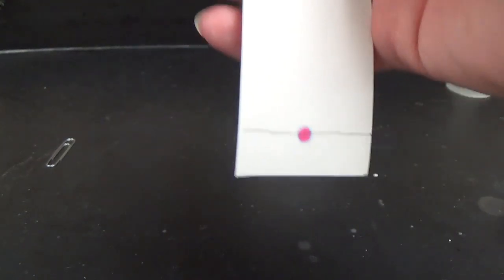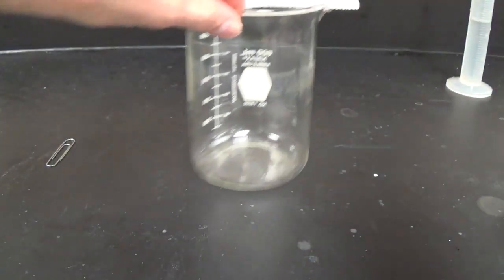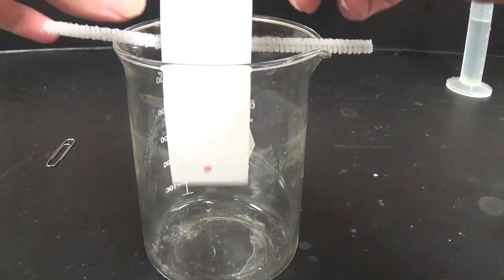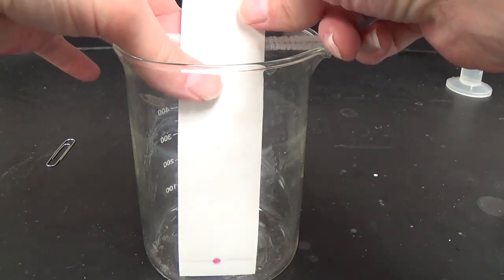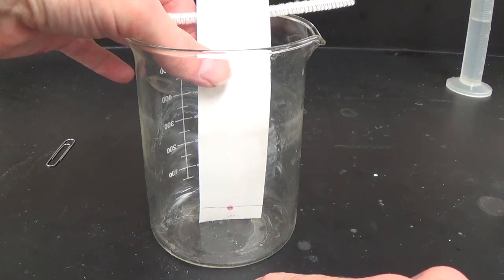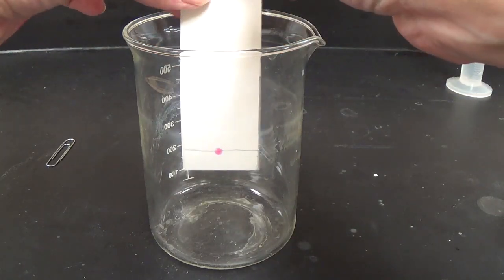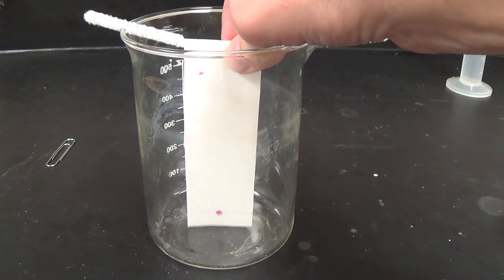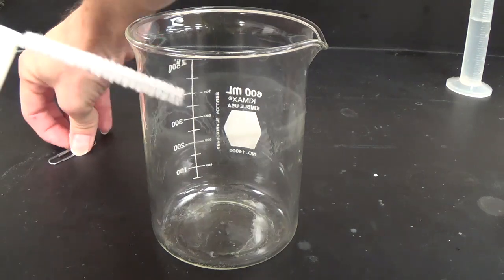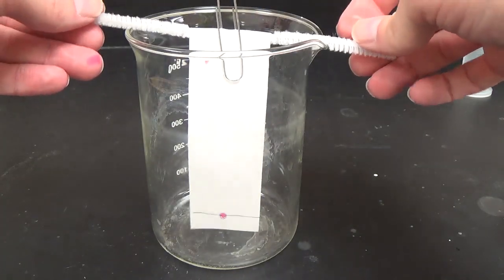All right. Now that I've got the purple on my starting mark, I'm going to size it up for the beaker. Notice the beaker is empty. I'm sizing it up for the beaker, and you could do this before you dot. It might even be better that way. But I want the bottom of the paper to just barely touch or even float slightly above the bottom of the beaker. So I'm going to wrap it around the pipe cleaner in such a way that it's going to hang barely touching or slightly above the bottom of the beaker, and then holding that in place up here with a paper clip.